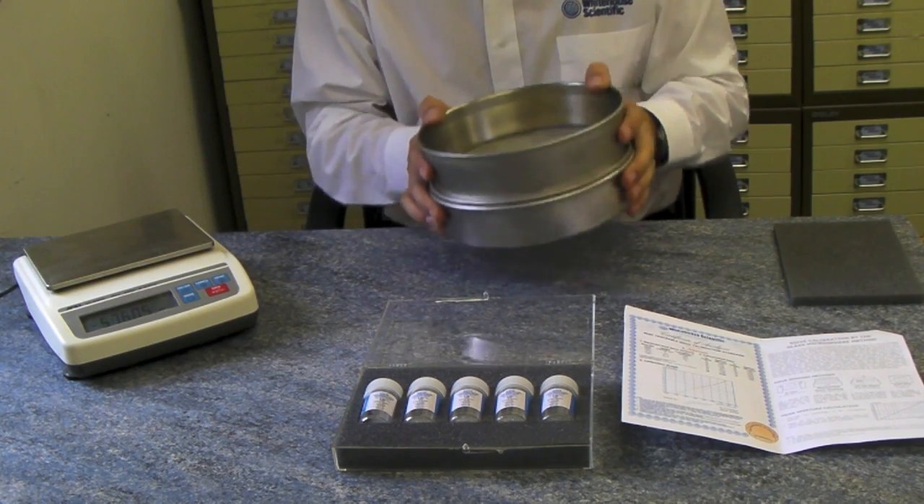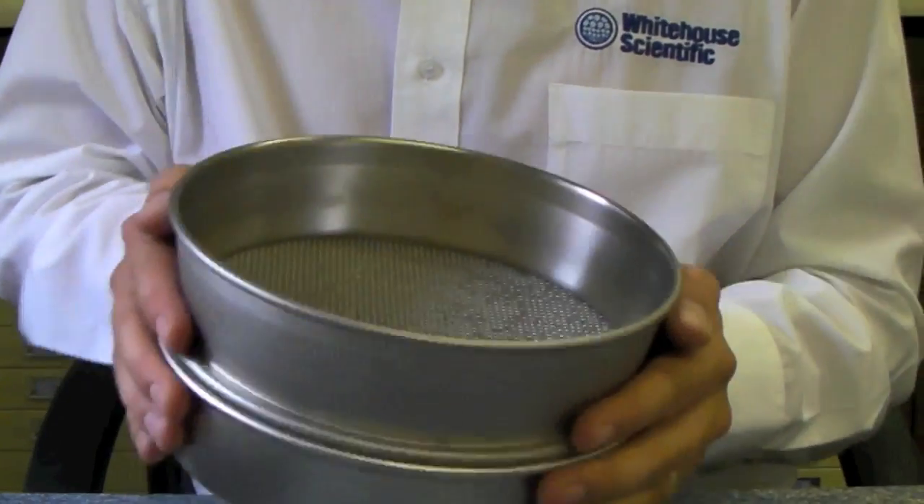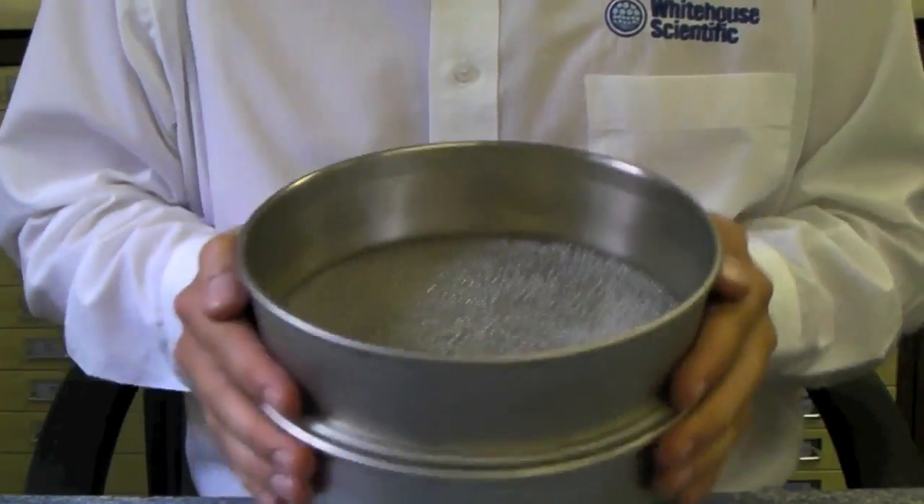Shake the sieve for one minute. This can be done by hand, as you see here, or by any other mechanical or sonic method.